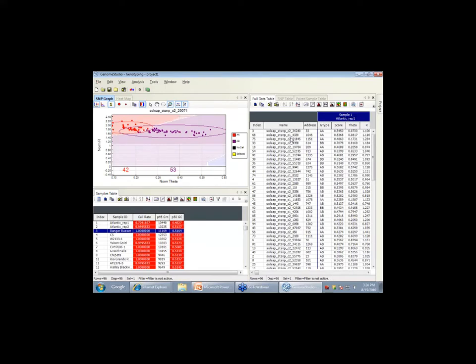So these are SNPs that occur between the GM and the RA? No, most of the SNPs were between the 3 varieties that we sequenced: Atlantic, Snowden, and Premier. And we did the transcriptome sequence only with Illumina. So they represent SNPs around genes. Would that be accurate, Robin?